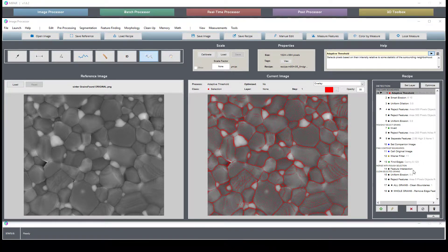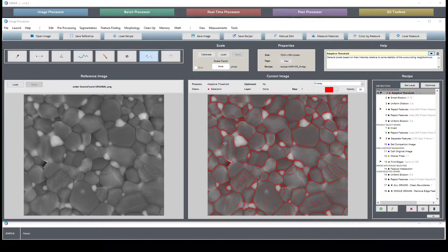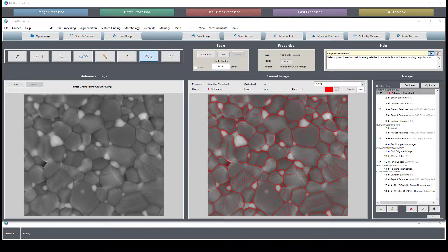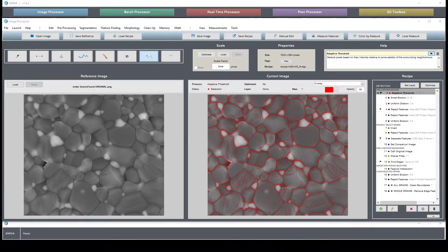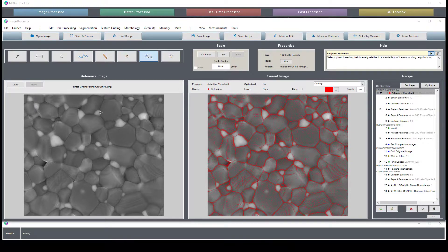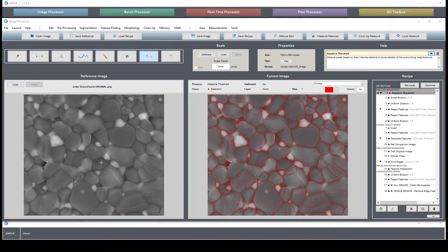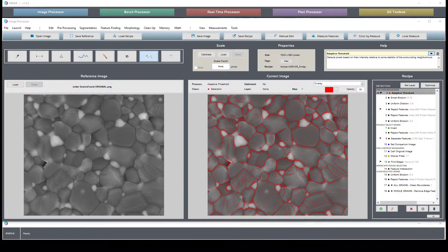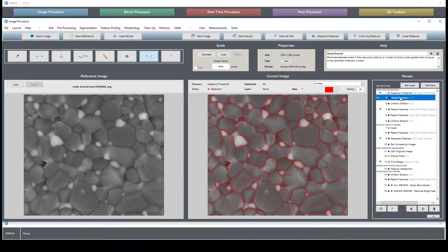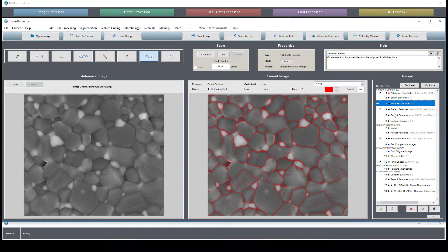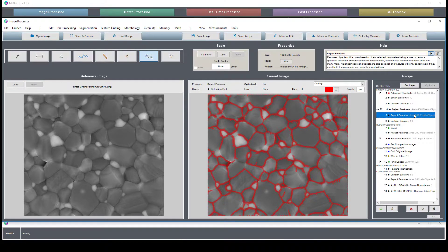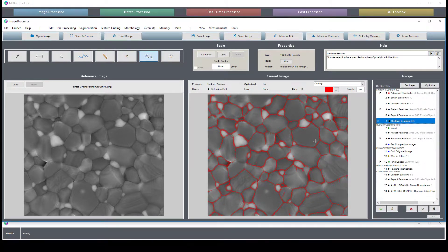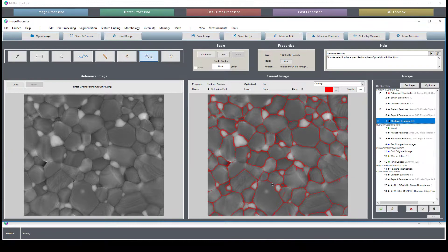So let's get right into it. What we're looking to do is to identify these dark lines which are characteristic of this sintered metal grain structure. So we do an adaptive threshold to pick up these dark boundaries, and then we manipulate the selection a little bit to result in a fairly accurate selection of the grain boundaries.